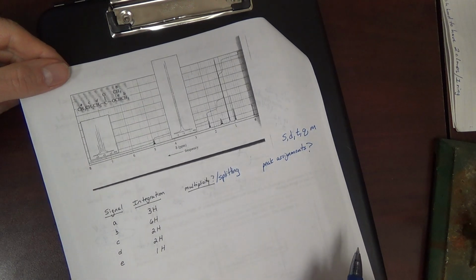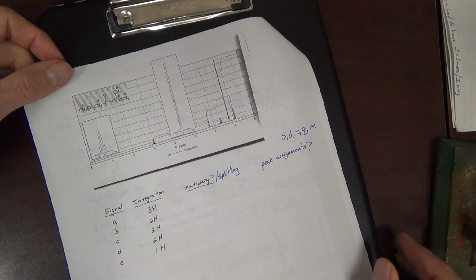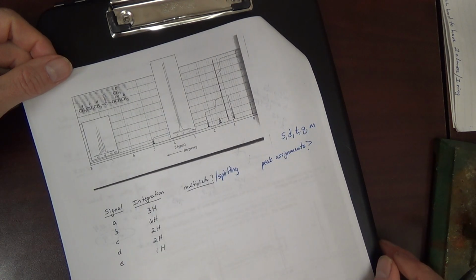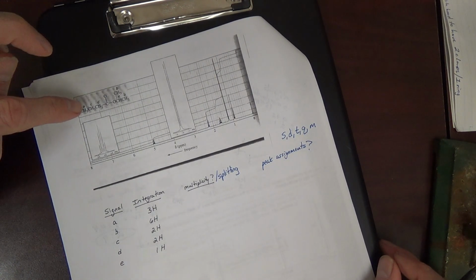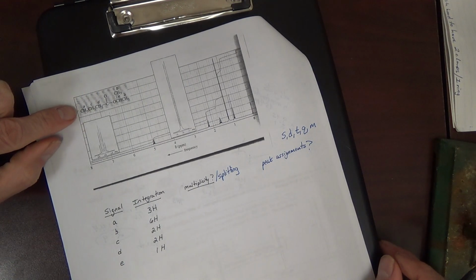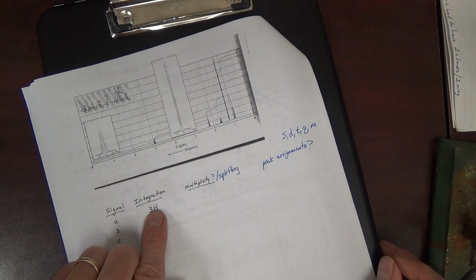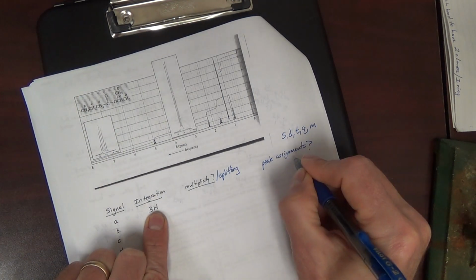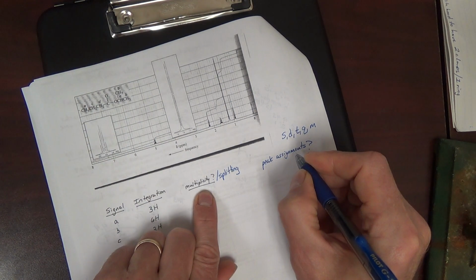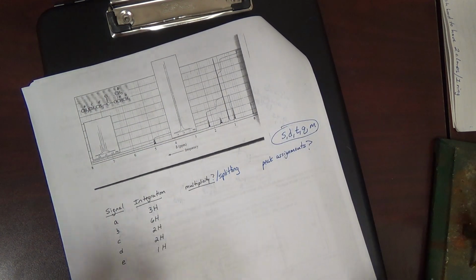But here's what I'd like for you to do. First, you're going to have to assign signals. Once you assign A, then you can look at it and tell if it's a singlet, doublet, triplet, quartet, or multiplet. All right?